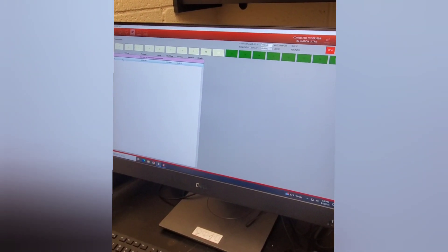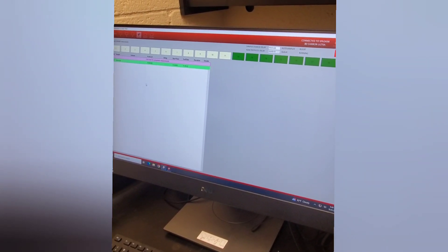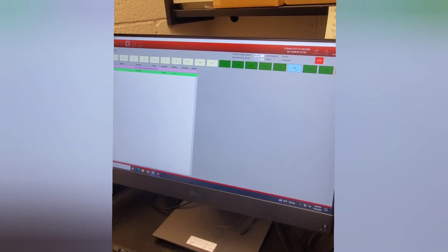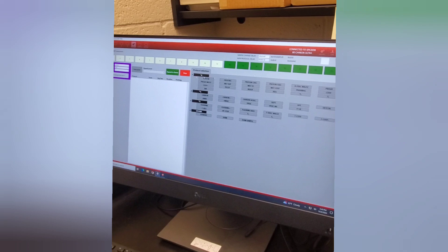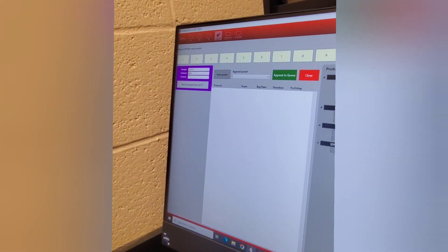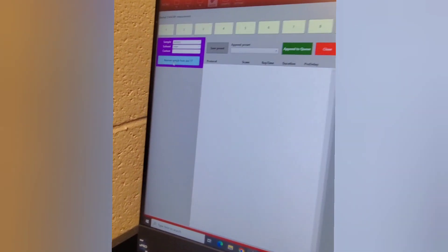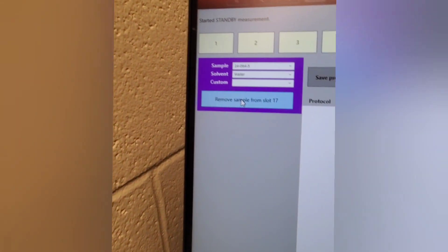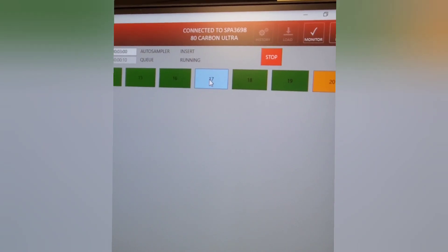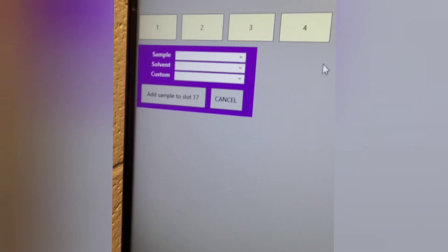Now what we want to do is load our sample into the software. We placed the tube into position 17, so I'm going to click on position 17 on the auto sampler. It previously had another sample in it — you can see the sample name there, the solvent is water. I want to remove that sample from slot 17 so I can put a new sample in. The color has changed from green to a whitish tan. I'm going to click on 17 and institute it as a new sample.